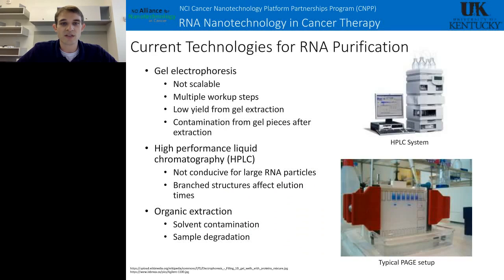So, some current technologies, and as a lot of you know, because you all answered the poll questions, all three of these were on there, except ultracentrifugation. There's gel electrophoresis, HPLC and FPLC, and organic extraction. These methods definitely do have their limits. I've worked with PAGE gels for my entire time here, and sometimes PAGE gels are limited by what you can do with them.